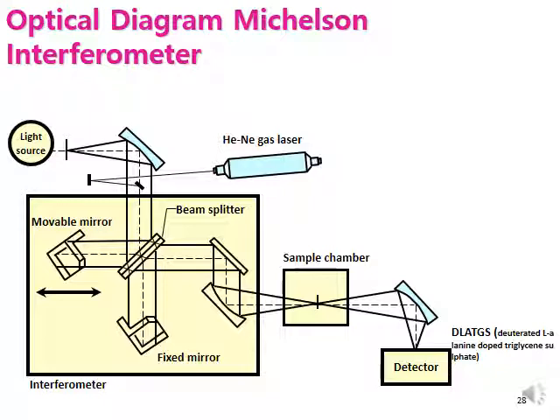After that, the light output will go to this mirror and directly to the detector. So we can estimate in a short period that the light source is near 100% passing through the sample.